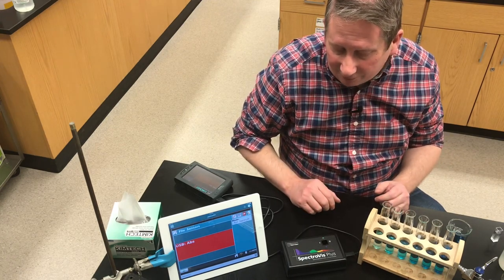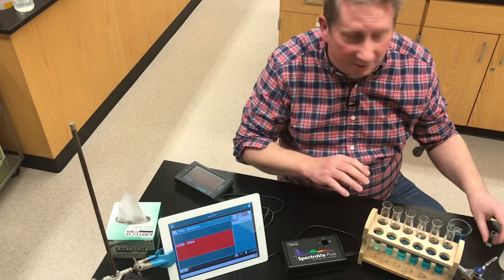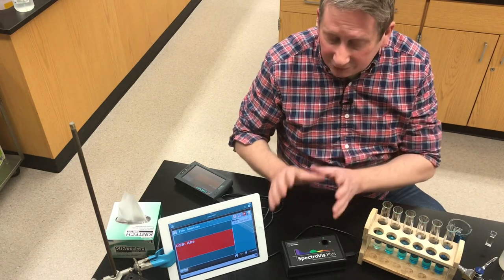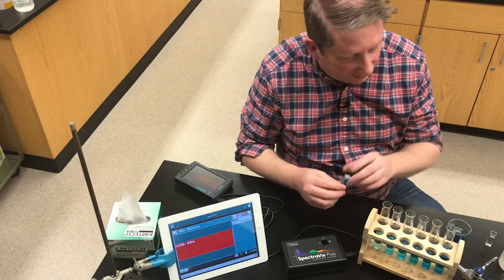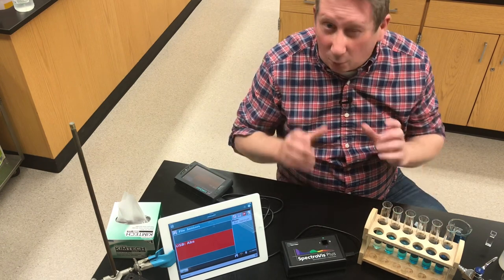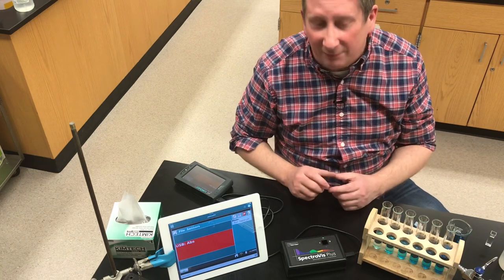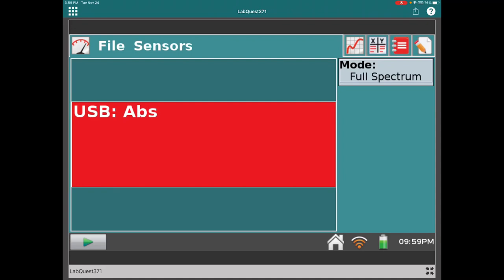We'll use a SpectroViz spectrophotometer displayed on the iPad to look at the absorption spectrum for malachite green. I've already calibrated it by inserting distilled water in a cuvette — all our solutions use distilled water as solvent, so the spectrophotometer now ignores water's absorbance. I have another cuvette with the malachite green stock solution. I'll insert that in the SpectroViz, and we'll press collect to run the full spectrum.